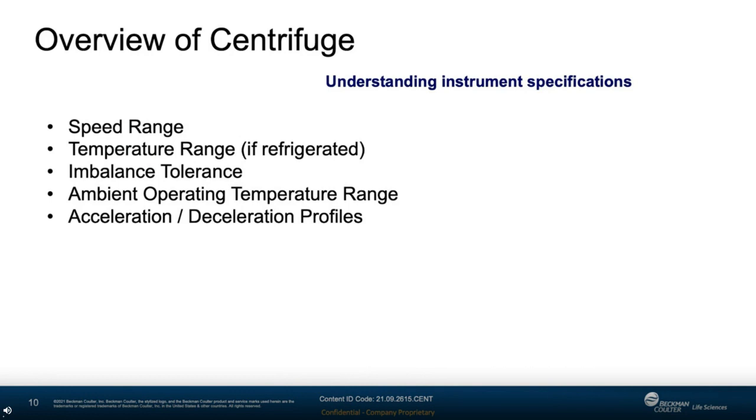These are 5 centrifuge run and environmental conditions which affect the separation and safe operation. When using a centrifuge, rotor speed and imbalance potential are always a safety consideration.